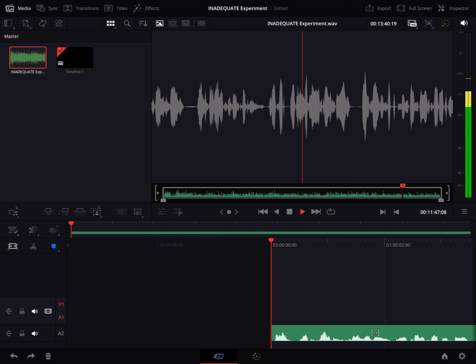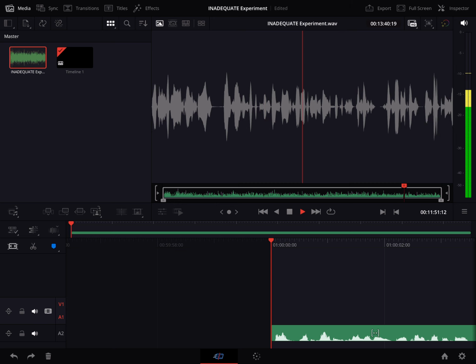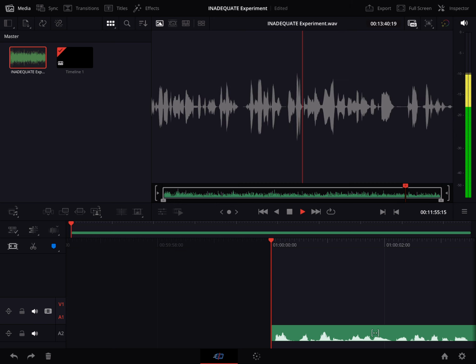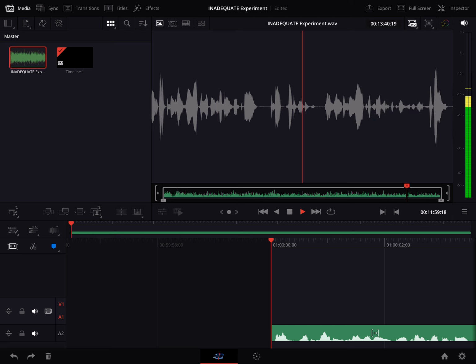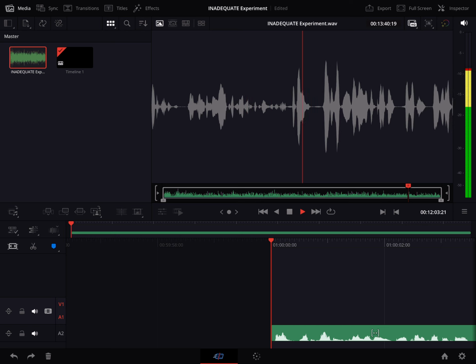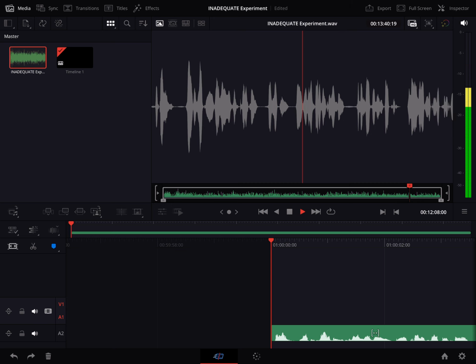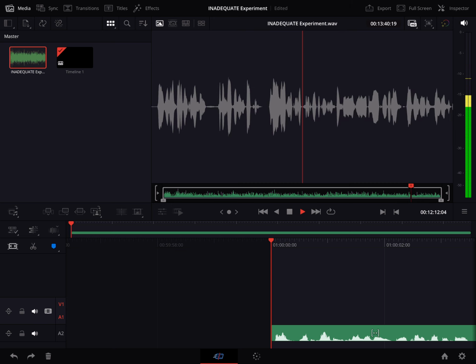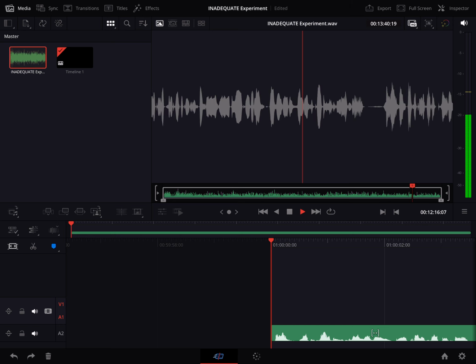So it's like each signal is telling a story, and scientists have to piece those stories together to understand the whole picture. Precisely. It's like solving a puzzle, but instead of pieces, we're working with these signals, these clues about carbon connections. I'm starting to see why it takes so much expertise to do this. It does. Scientists have to use their knowledge of chemistry, physics, and even a bit of intuition to decipher these spectra. And I imagine it can get pretty complicated, especially when you're dealing with a molecule that has dozens or even hundreds of carbon atoms.